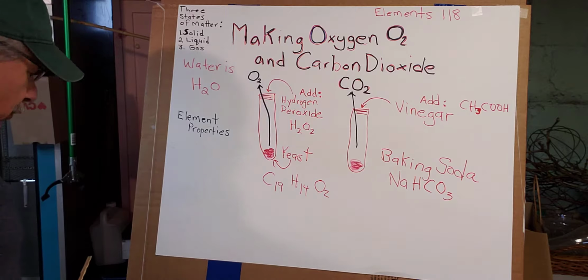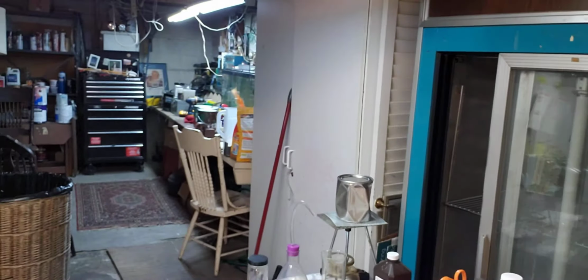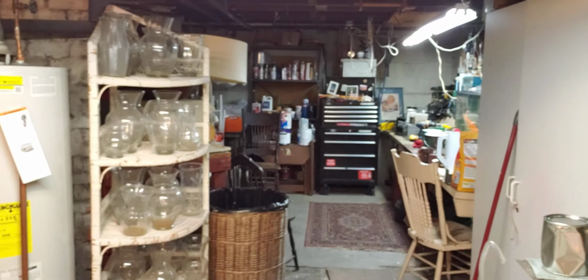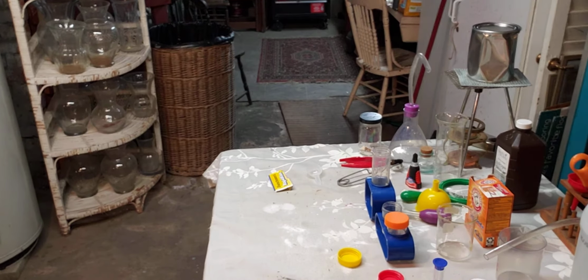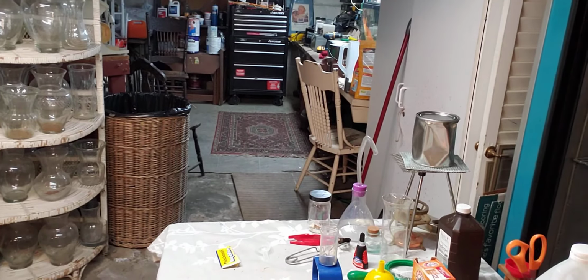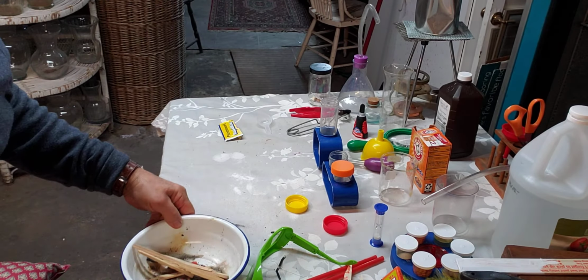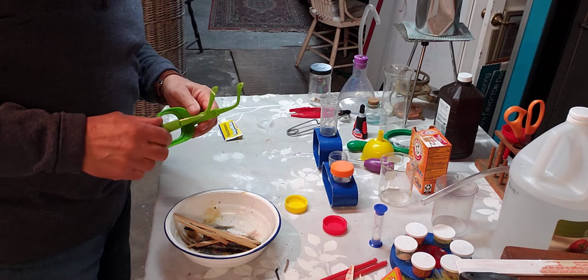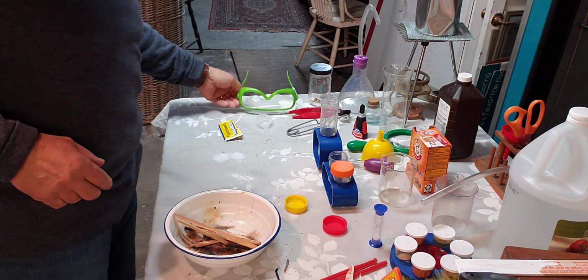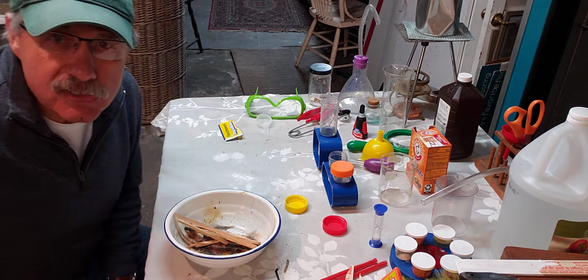Okay, let's go over to my work table, and I'll see if I can get this in position so that you can see exactly what I'm doing here. Okay, I gotta be very careful on camera. My phone doesn't fall off here. Let's bend this down a little bit. There we go. All right. Now, usually I wear glasses, but I have my other glasses on today, which will be a protective shield for my glasses. Can you see me?